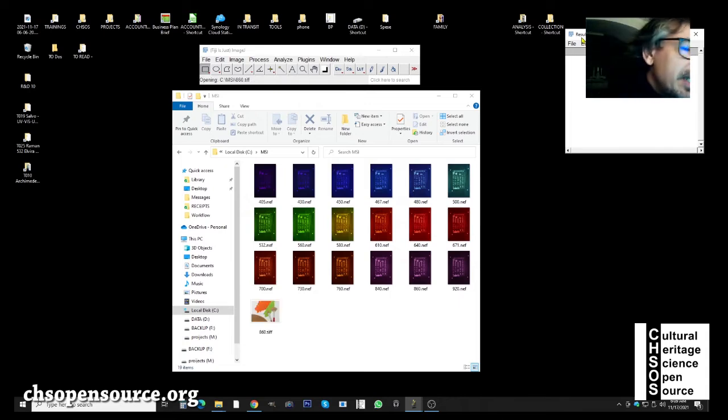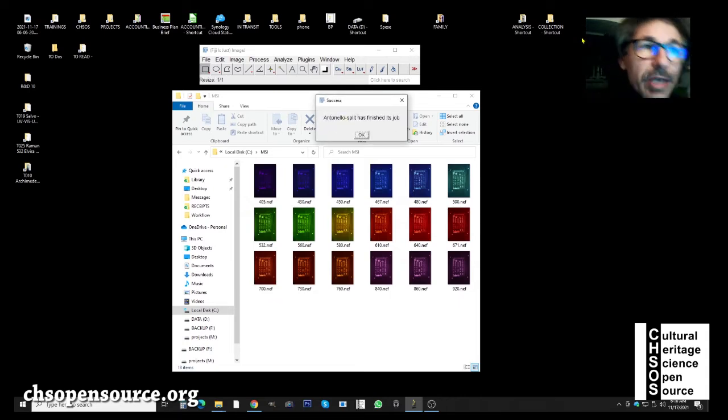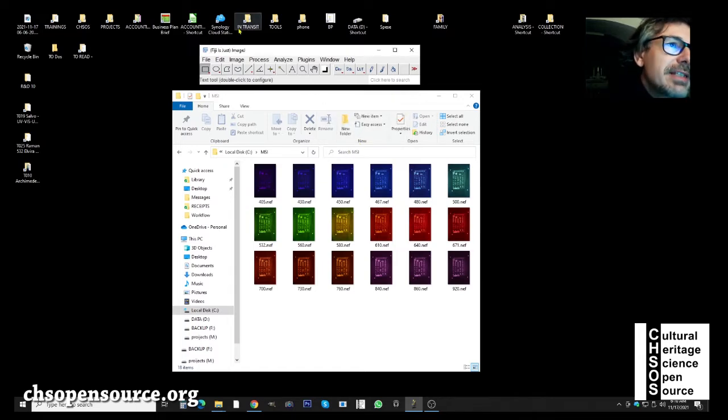Because the idea is that the brighter the image, the less noise we have. So we have a clearer image. So that one will be the image selected. Now the process is done.